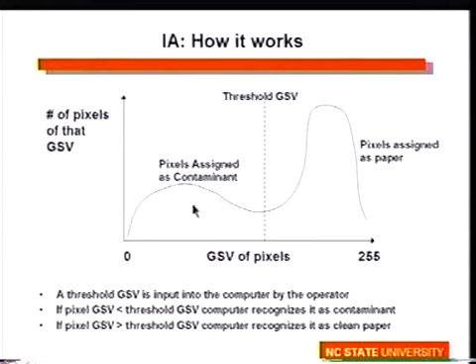This first peak is with the darker ones, so this would correspond to ink particles. So we would say that this is area covered by dirt. This peak up here near the 255, the brighter, whiter area, are pixels that we want to assign as paper. Okay, so our white pixels are paper, and our black, darker pixels are dirt.